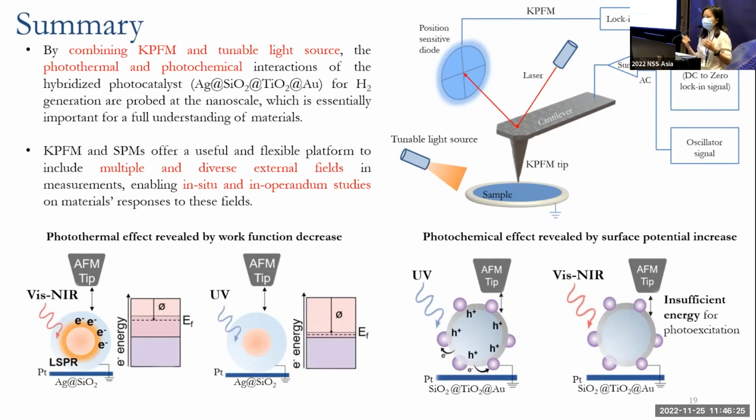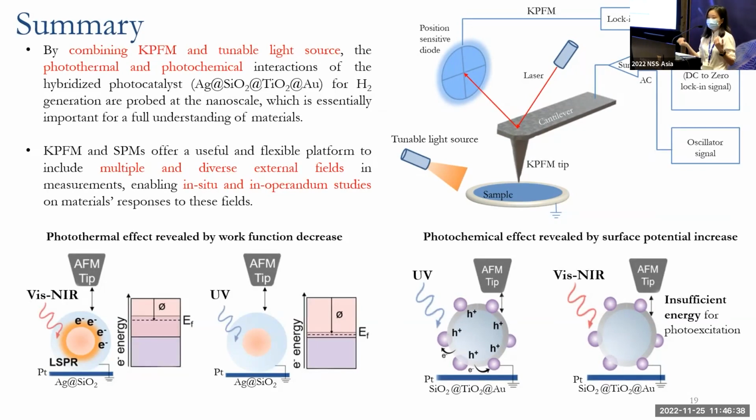From this work, we can see that KPFM and SPM can work as a useful, flexible platform to include multiple and diverse external fields in our measurement, which enables in situ and in operando studies on materials' response to these multiple external stimuli.